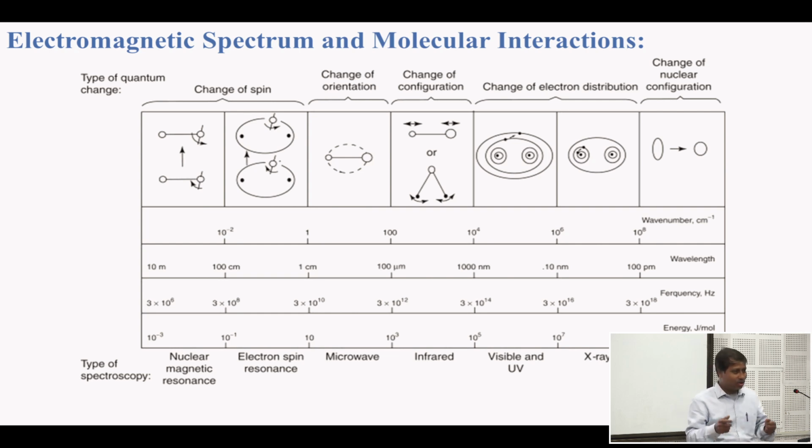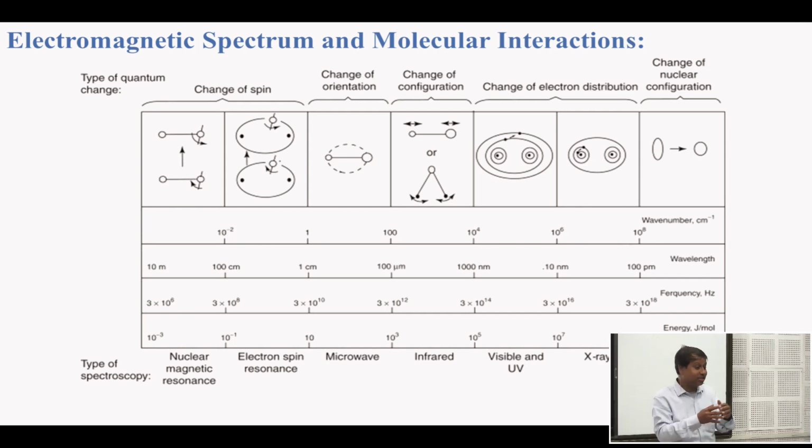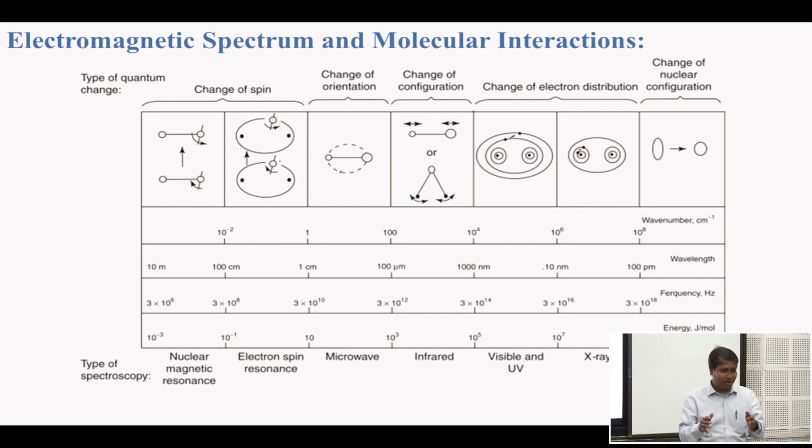The chemical system, or the system that you make in your lab, is much easier compared to the biological system. In a chemical system you take some 3 ml of, say, hexane or ethanol, put a molecule in that, and study it. You know that you have one molecule, and whatever spectra come, they come from that molecule, so you can analyze nicely, with no unknown factors. But when you talk about biological tissue, you have many types of molecules, and most of the molecules you do not know.